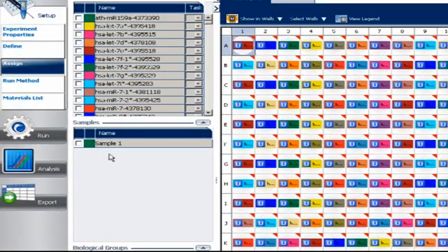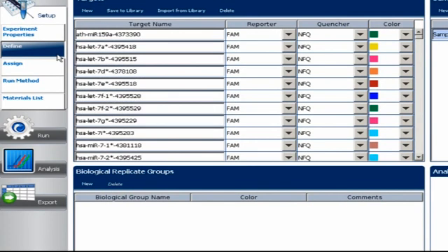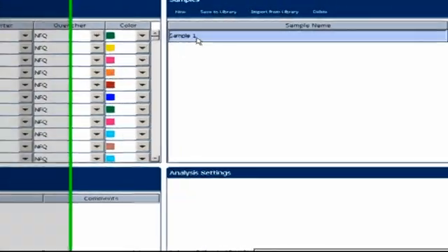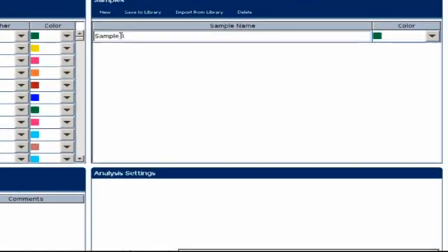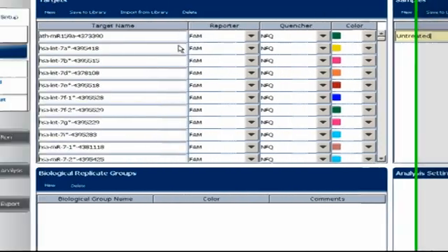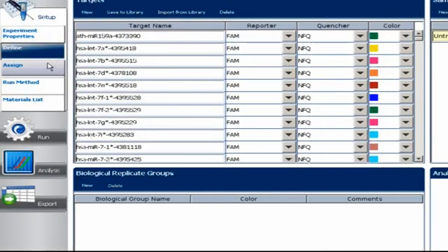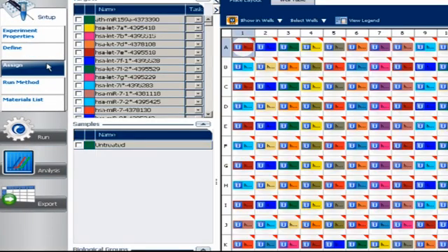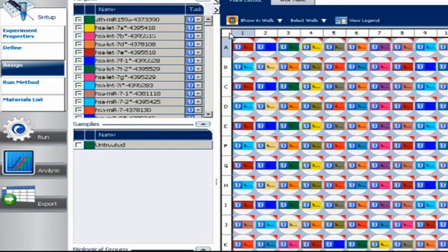Now, all we have to do is assign sample names. This procedure should be familiar. Under Define, we can enter between one and eight sample names, depending on how many we loaded. Then, back under Assign, we simply select wells containing each sample and click the appropriate box.